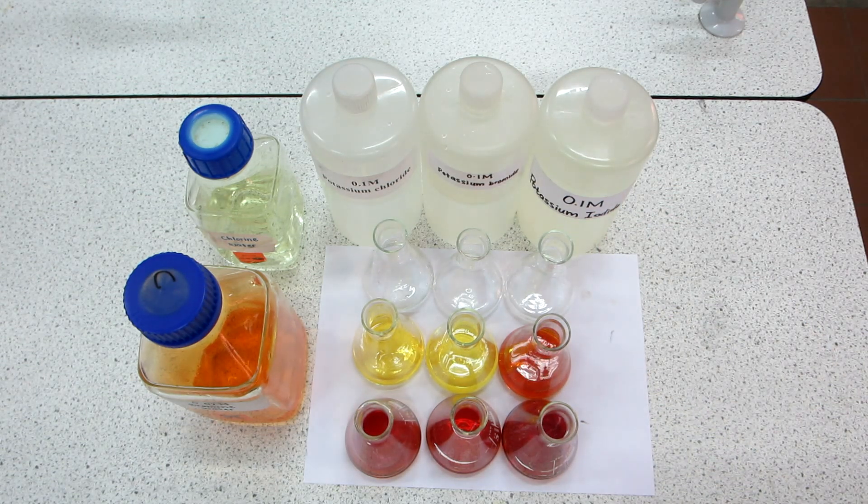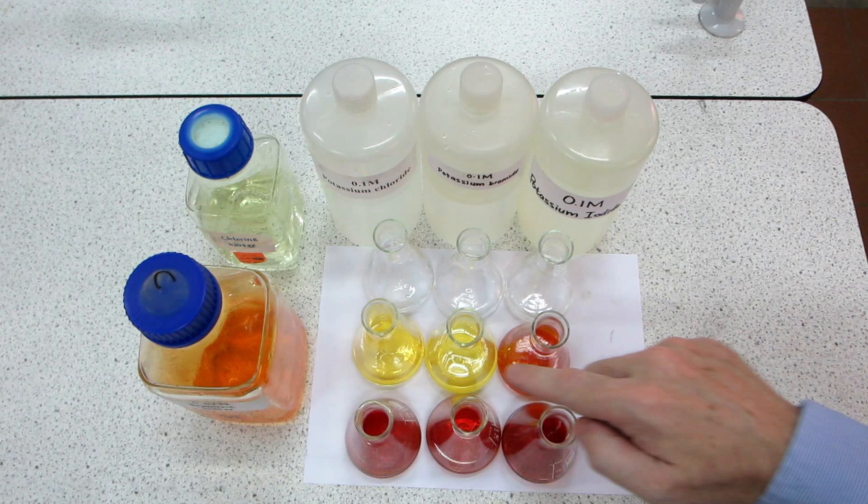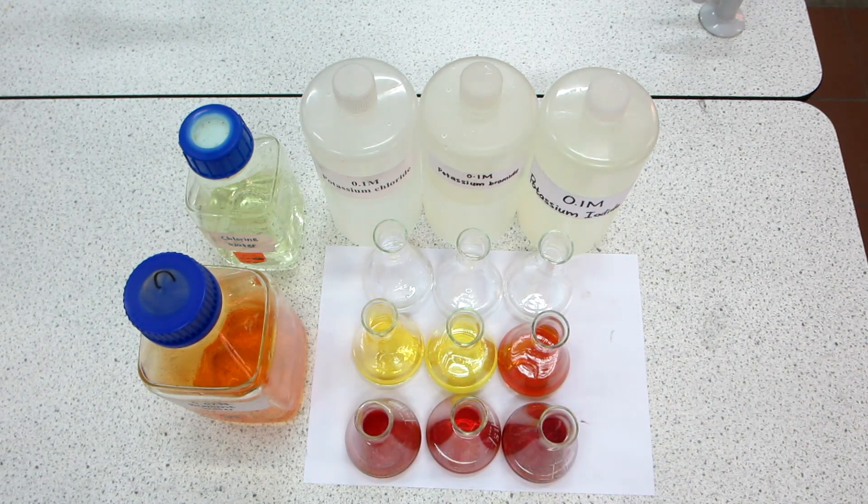Hopefully you can see that the bromine into potassium iodide has turned a much deeper orange color than the other two, perhaps indicating a difference in the reaction.